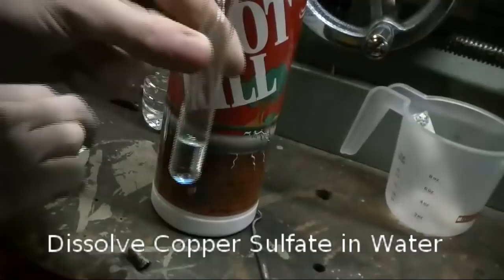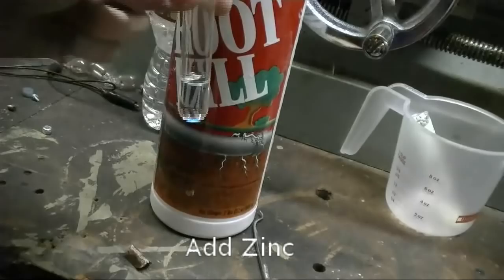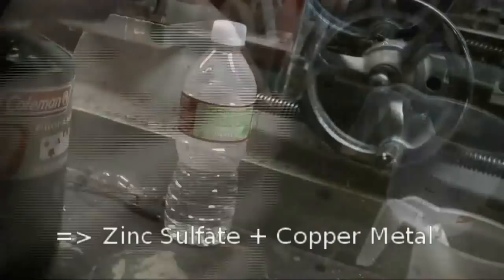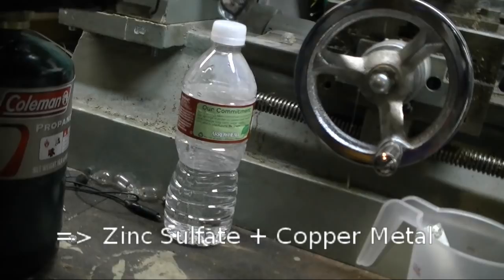I ground the copper surface off of a penny, a newer penny, to get to the zinc, because we're trying to make zinc sulfate. You can buy zinc sulfate from the store, they use it as a roof demoss agent.